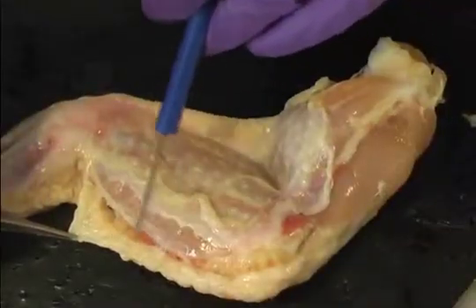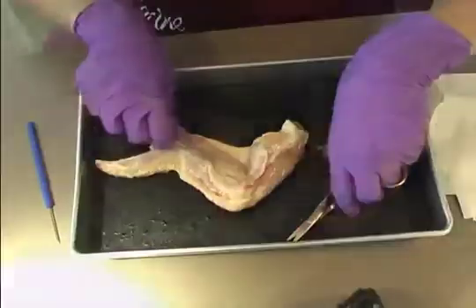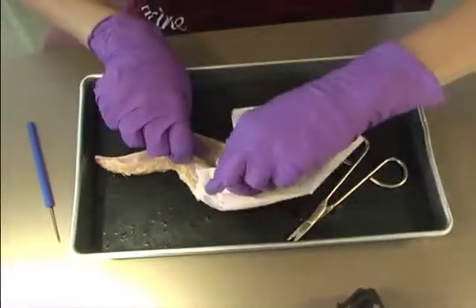Pull the skin back gently from the muscle to see a layer of yellow fat under the skin. The fat makes the skin greasy, so blot it dry with a paper towel.